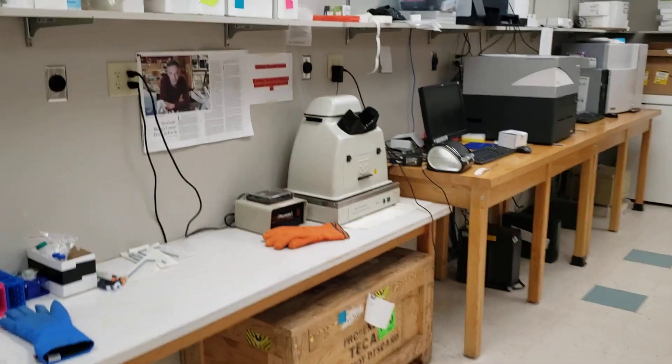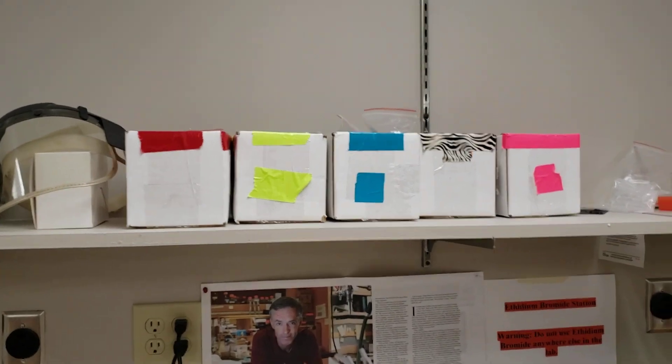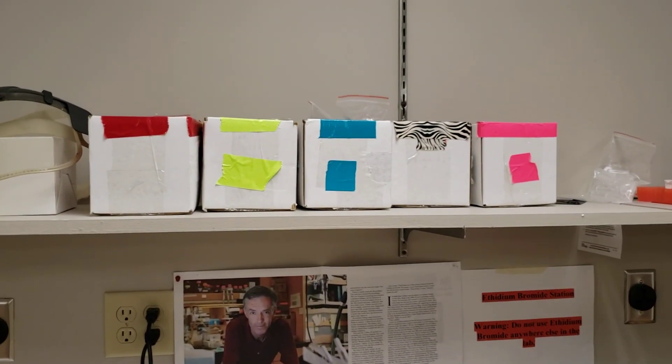As you keep walking around the lab, you can see all the other boxes we've created with all the colors that match everything for the different lab groups.